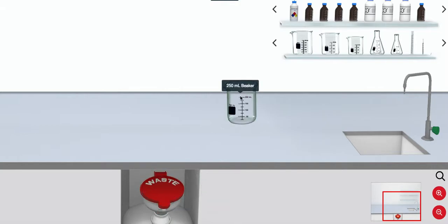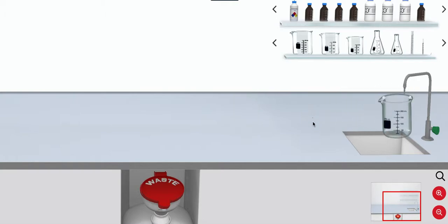Any used glassware must be placed in the sink and equipment moved back to the shelf.